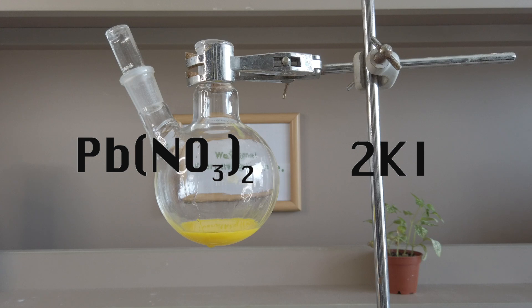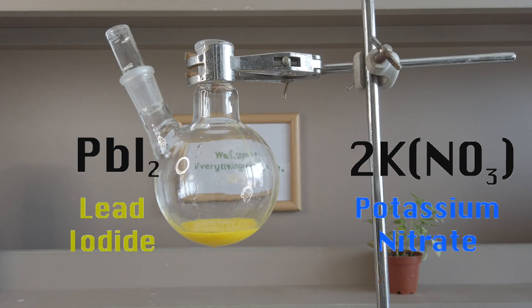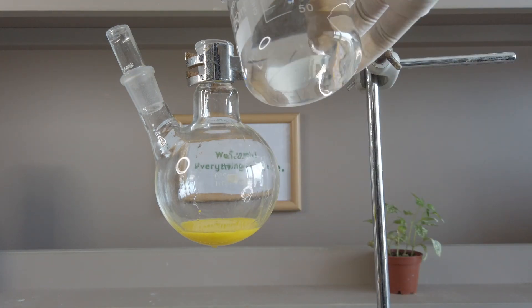The potassium iodide reacts with the lead nitrate to form potassium nitrate and lead iodide solid. The lead iodide solid is yellow in color and gives the solution a golden yellow appearance.